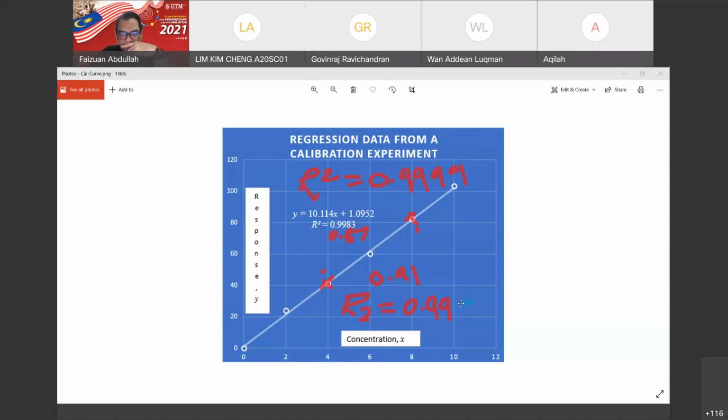5. Okay, good from Lim. Okay, 0.995. How to annotate this? Okay, this is the minimum one. You should get this right in the analytical science, right? If you want to discuss any results, this is the acceptable one.